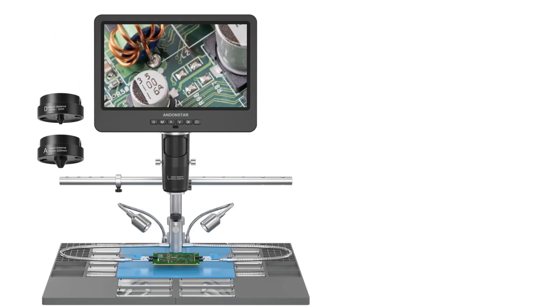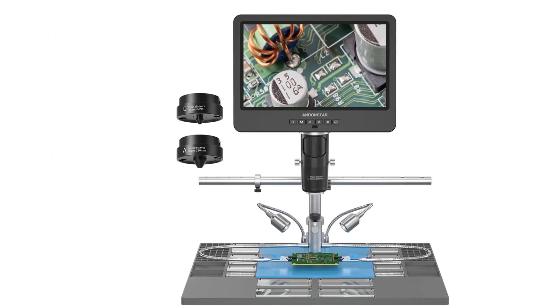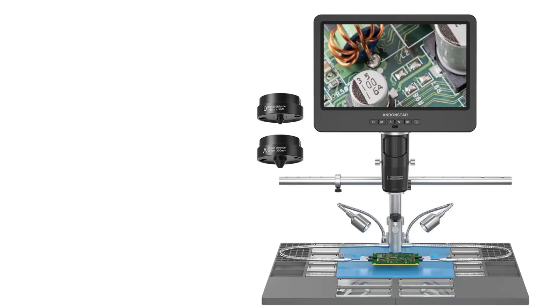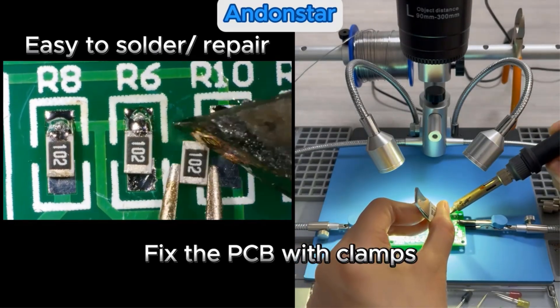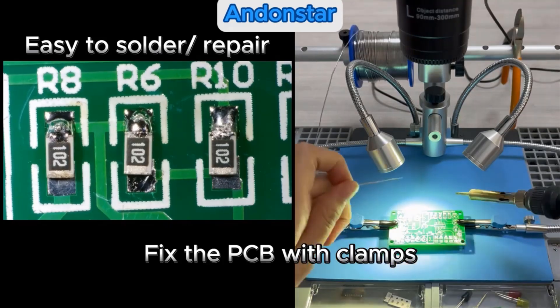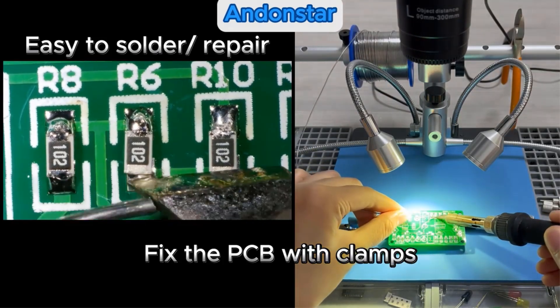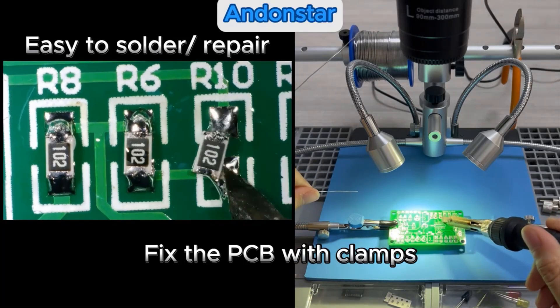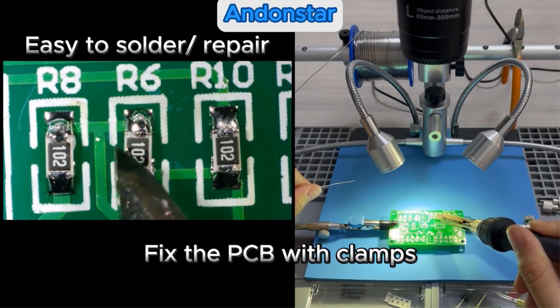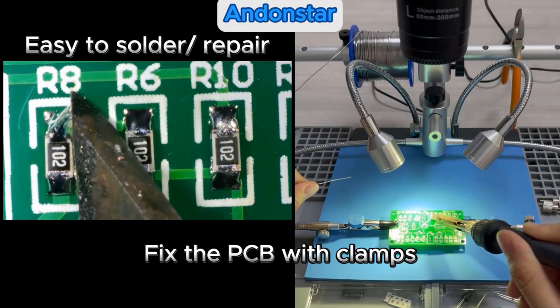It features a 7 or 10-inch screen, adjustable minimum focus distance of 4mm, and a range of lenses including A, D, and L for varying observation distances. The microscope is powered via USB and includes an upgraded metal stand, remote control, and necessary accessories, making it a comprehensive tool for detailed examination and analysis.